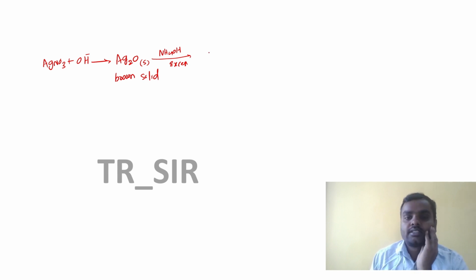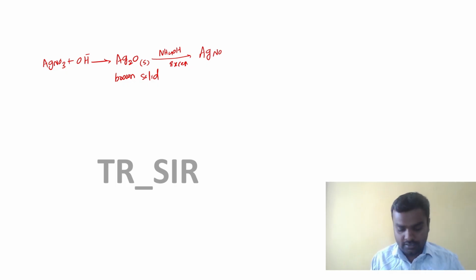Excess ammonium hydroxide, so it will form [Ag(NH3)2]+ OH-.